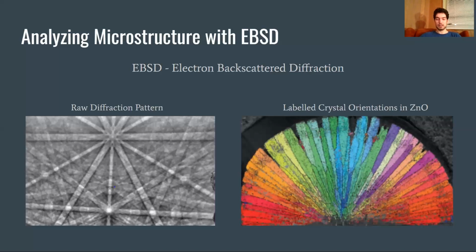So that's really useful. This can allow you to determine relative orientations of grains in polycrystalline materials. That's what the example of the zinc oxide crystal is showing there with columnar grains, where the colors of the grains indicate the crystallographic direction that you're viewing it from, essentially.